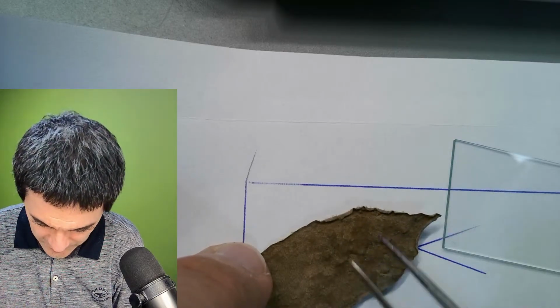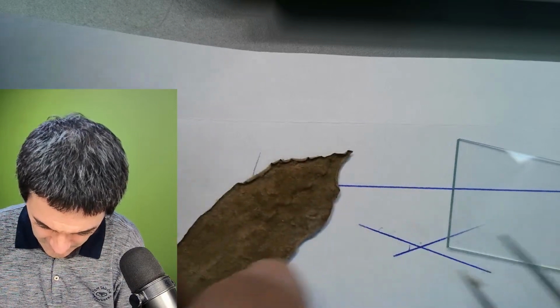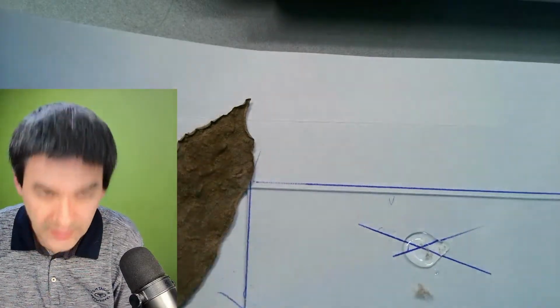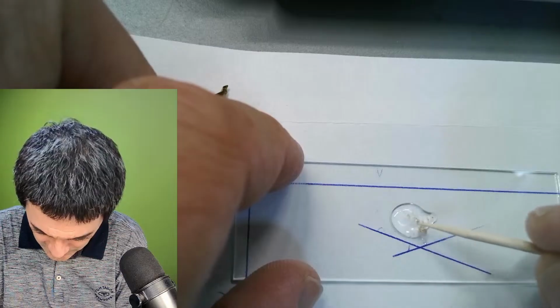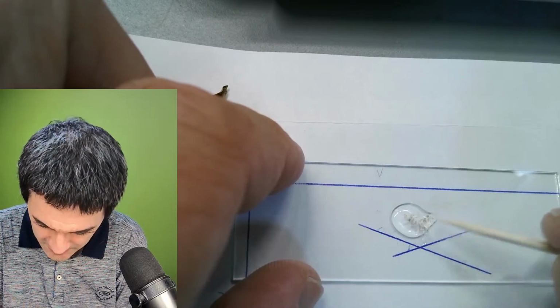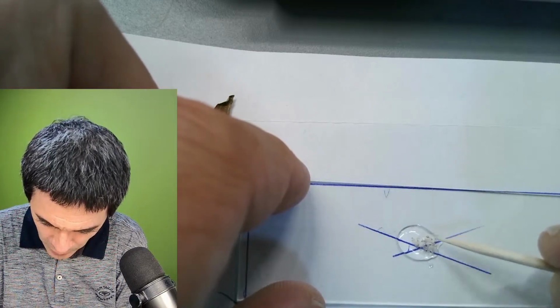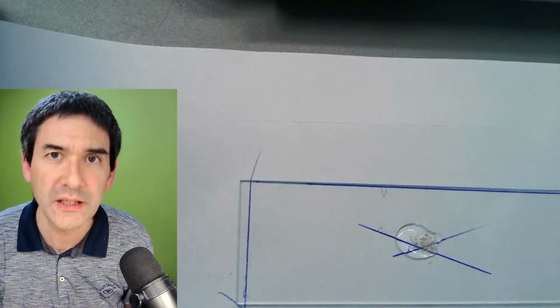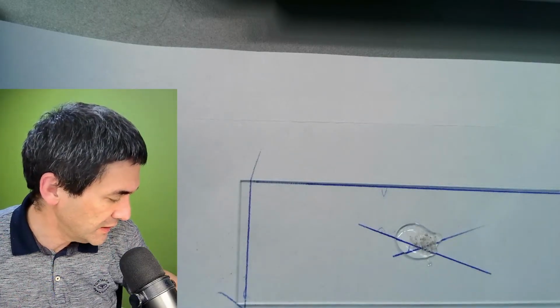This fuzzy. Here it is. Do you see this fuzz? And these are the trichomes. Make sure that they're properly submerged. It might also be an idea to moisten them first a little bit in some water, maybe to drive out any air that might be present. I'm just going to do it in any case like this.